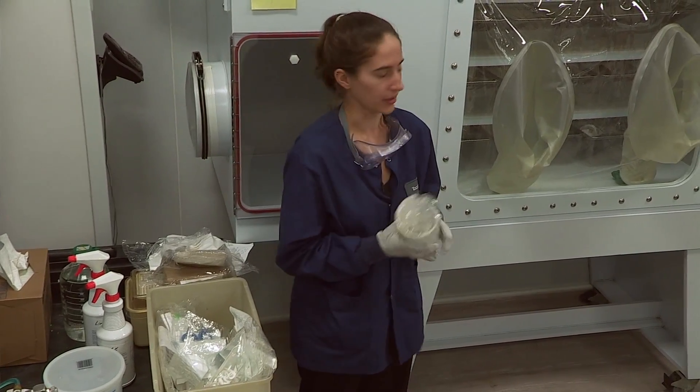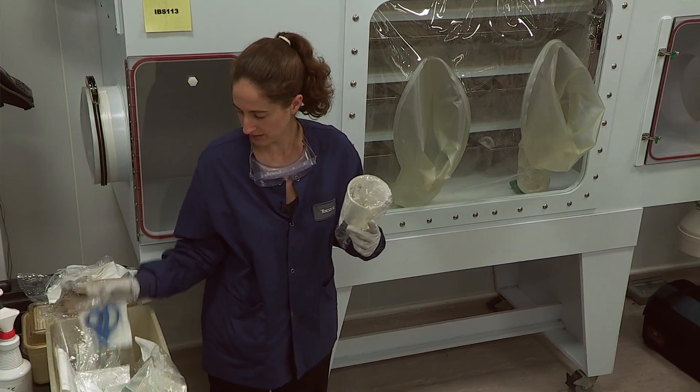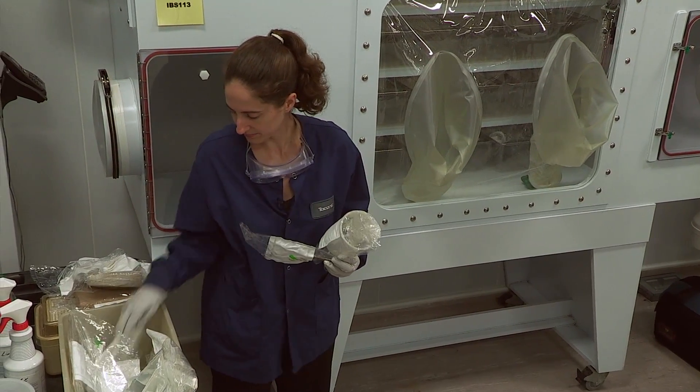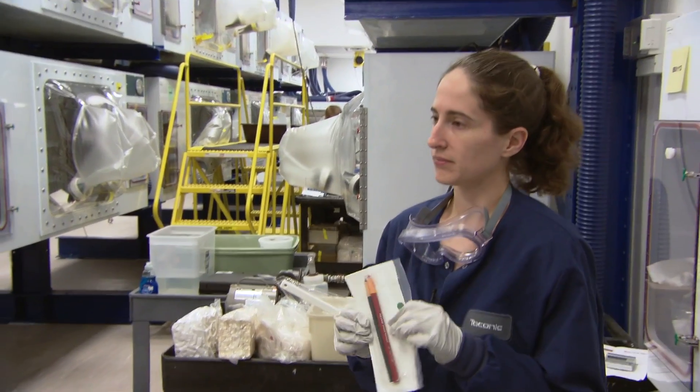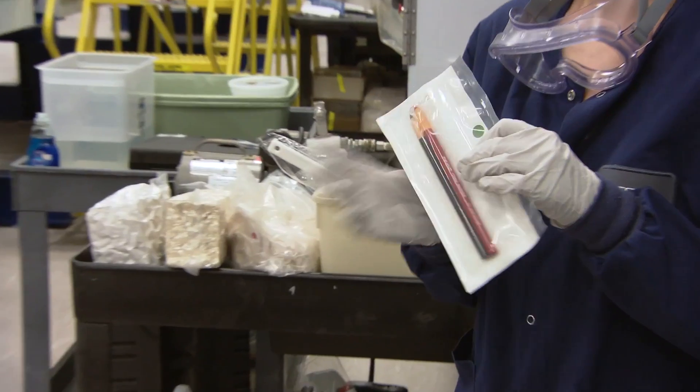Every isolator we put a beaker or some kind of container to hold things, scissors. We use grease pens on our cages instead of a cage card.